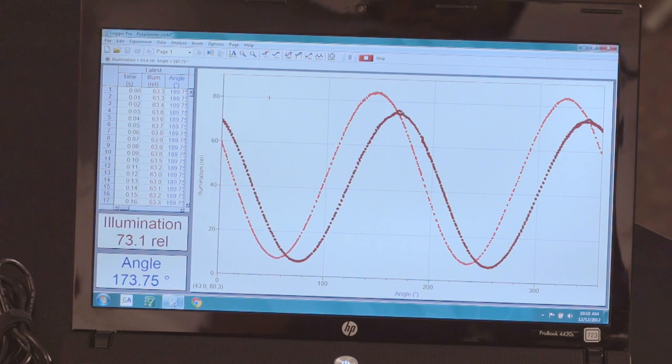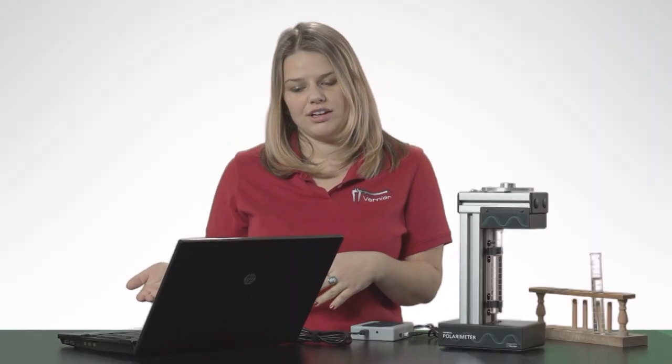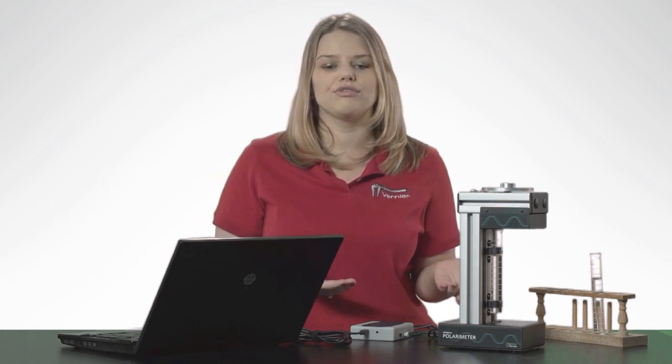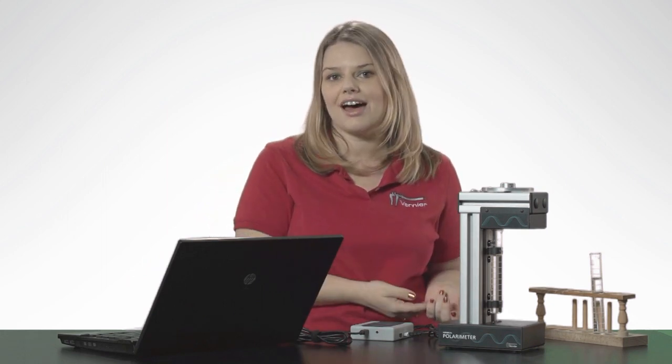You can see right away qualitatively that the cosine squared waveform has been shifted to the right. Sucrose is therefore a right-handed molecule. If I had used a negative sugar, like fructose, I would have gotten a shift to the left.